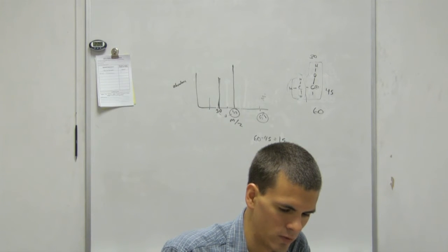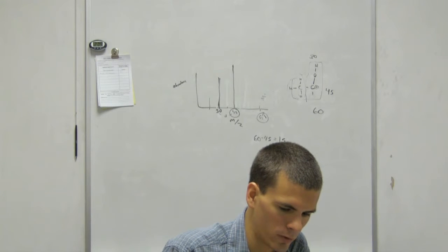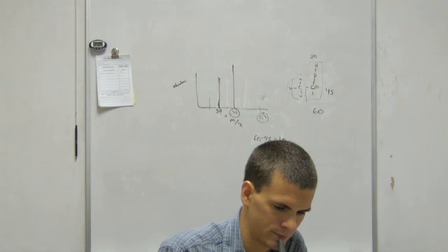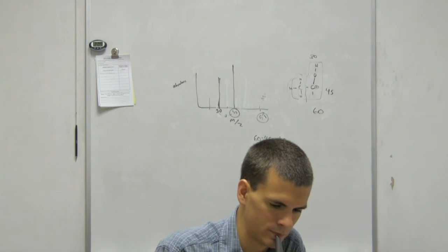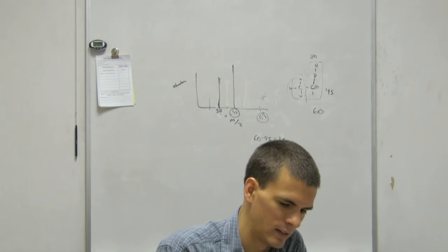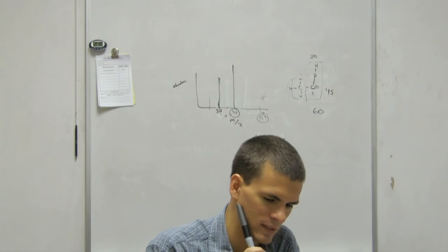Yep. And then you can change your C to an H or an O. Let's do O first. Okay. And then the O will go right above the C, yep. Here. Yep. And then we could change it to an H, and add 3 H's around that C, an H, and an H. Perfect. Okay. Perfect. And then just click on the line and connect them all. Oh, dang it. Yeah, it's kind of tricky.